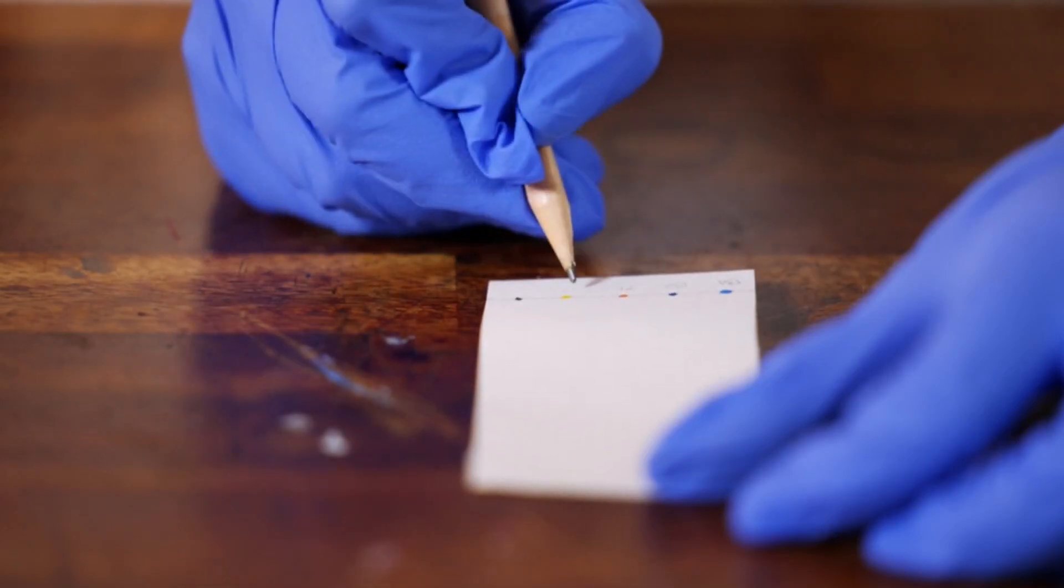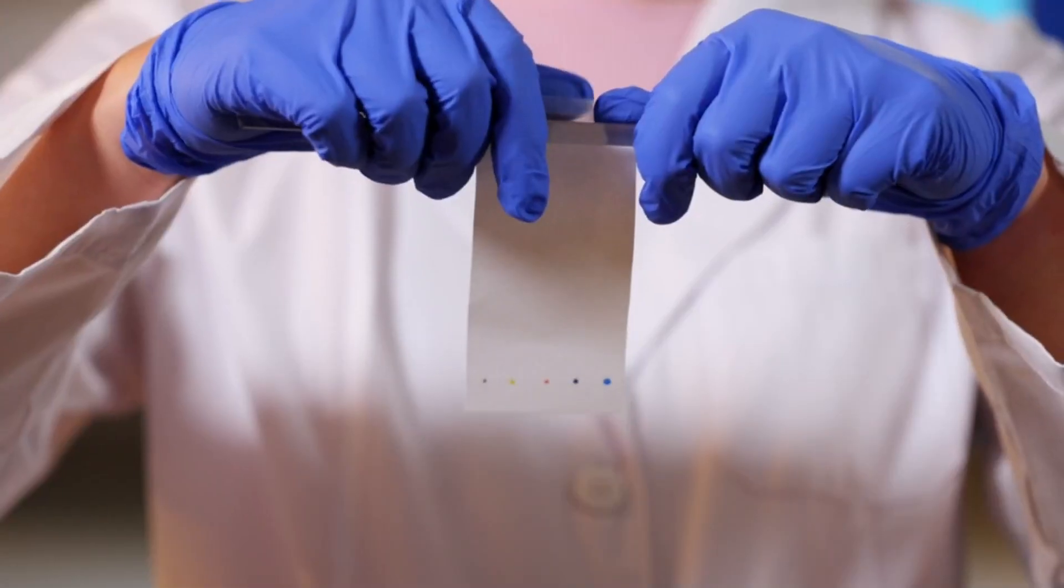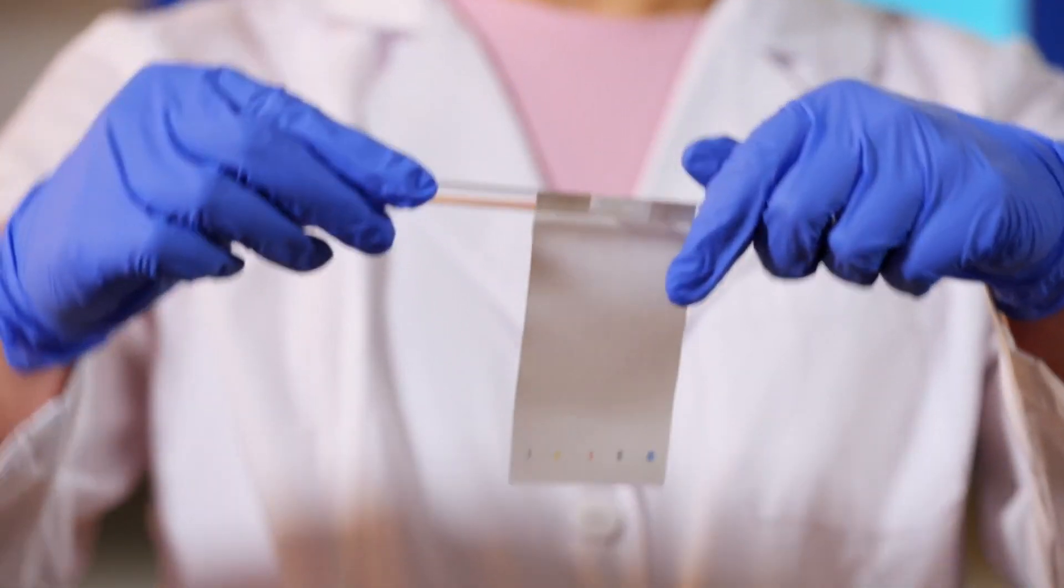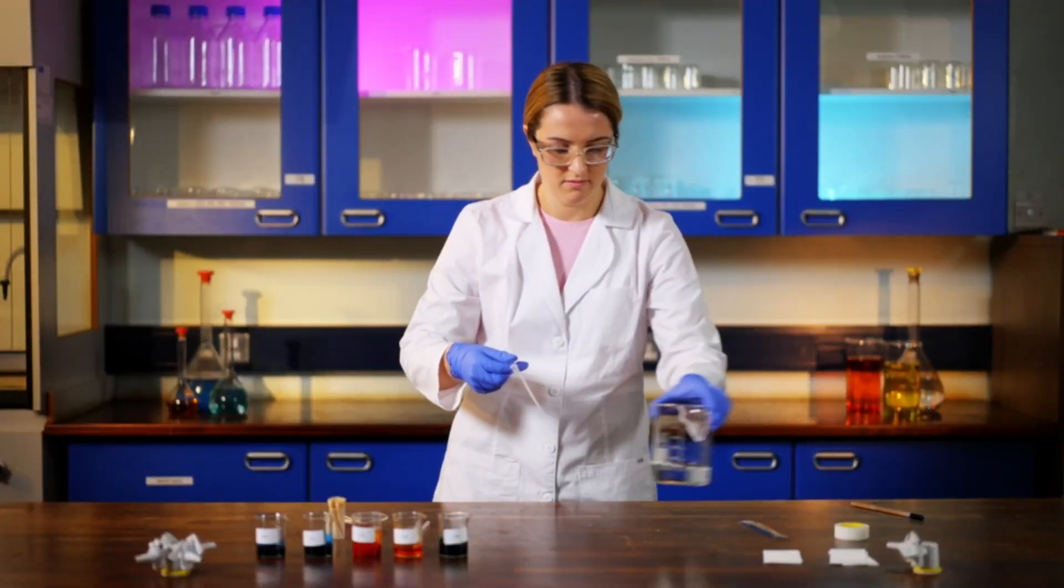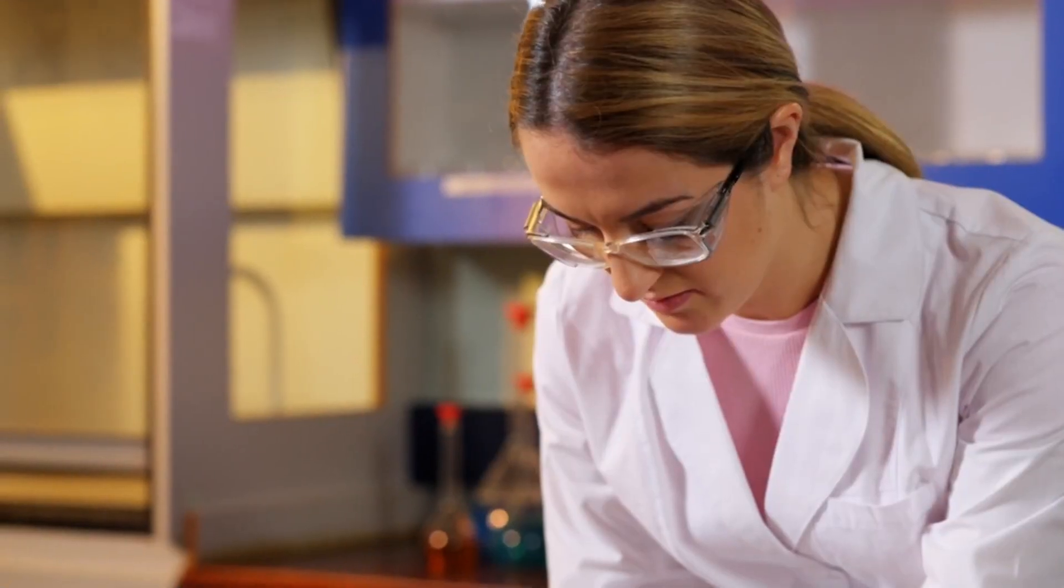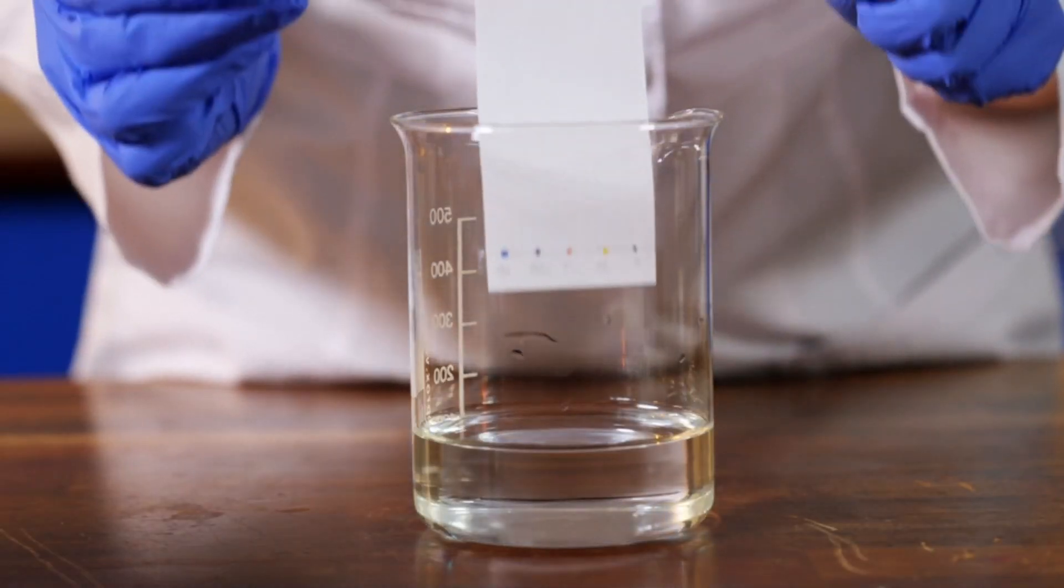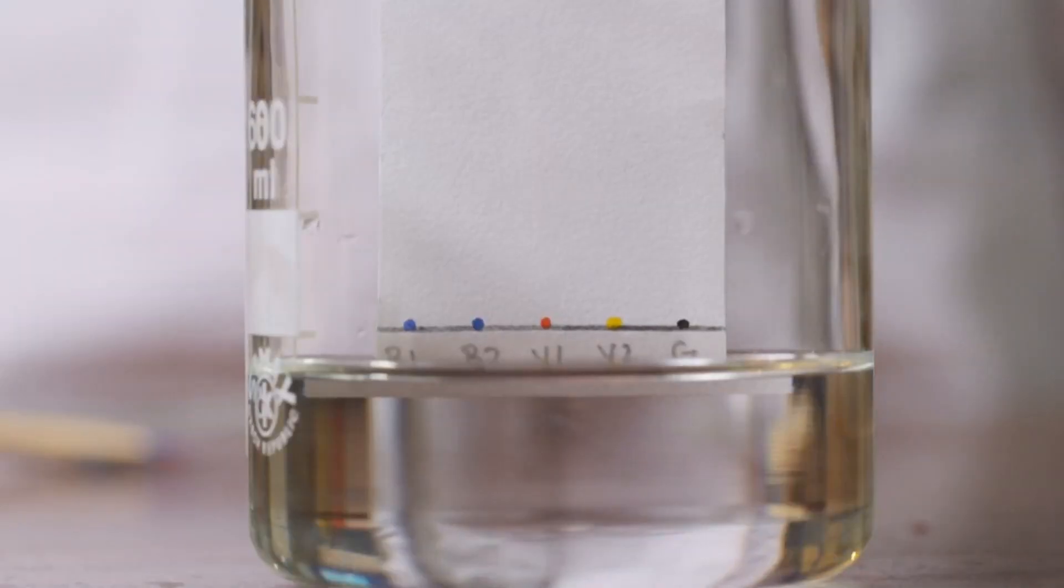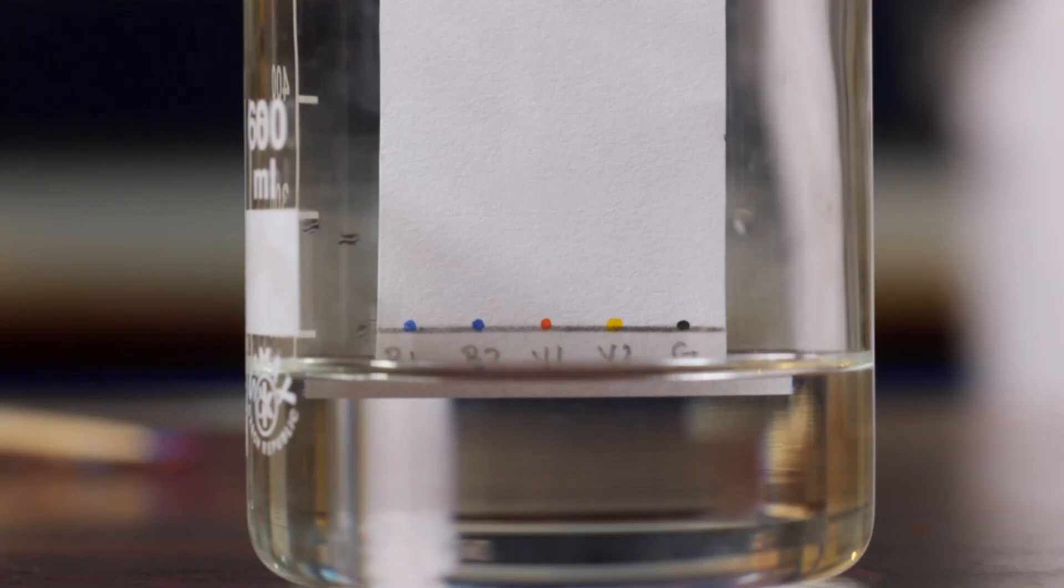Then use a pencil to label it. Now attach the paper to a glass rod or pencil using tape. Put some water into your beaker just deep enough that the very end of the paper goes into the water. Carefully lower your paper into the water letting the glass rod balance on the rim of the beaker. Make sure the pencil line is above the surface of the water.